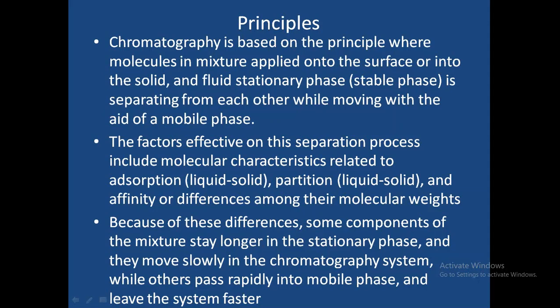Because of the differences in using the mobile and stationary phase, some components of the mixture stay longer in the stationary phase and they move slowly in the chromatographic system, while others pass rapidly into the mobile phase and leave the system faster.